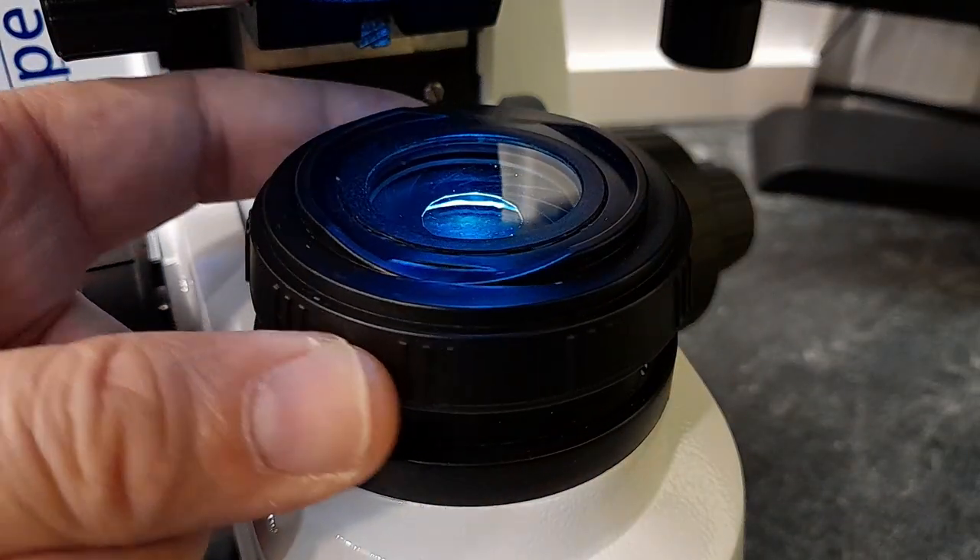Concerning the eyepieces, these are so-called student-proof eyepieces, meaning the eyepieces cannot simply be taken out — there are two screws that you have to loosen first. This is referred to as making the microscope student-proof so that students are not able to steal the eyepieces. In an educational or laboratory setting where multiple people use the same microscope, the head of the microscope can also be rotated quite smoothly, which is convenient if two people want to use the microscope concurrently. The B-Scope also has a field diaphragm, which allows you to restrict the light only to the part of the specimen you want illuminated, reducing internal reflections and increasing contrast in some specimens.